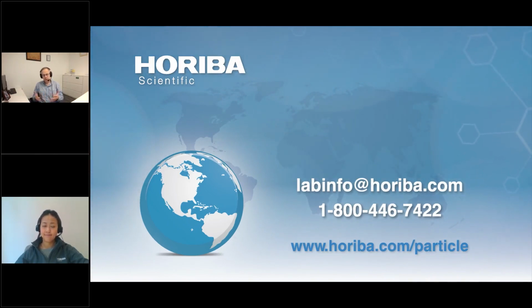Again, it's very rare, but it might be something in temperature control on the system. So the calibration system is really built in when it's manufactured, and we just confirm it's still working. It's not like a microscope where you put in an artifact and you adjust a knob to get the length scale back out because it drifts with the weather. It's just going to stay there.